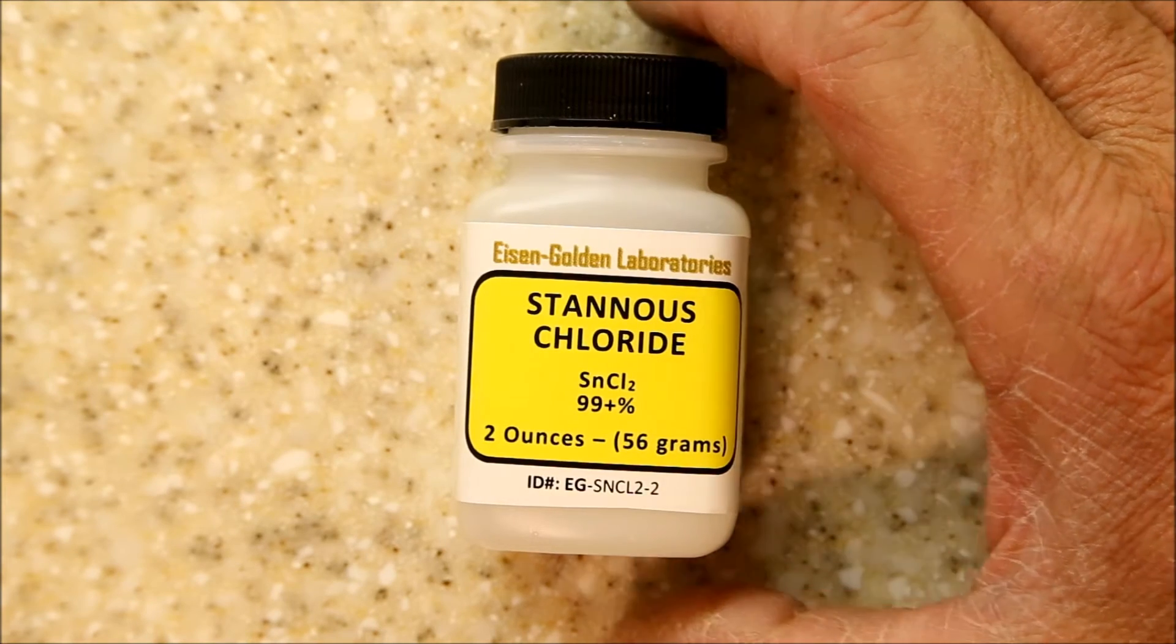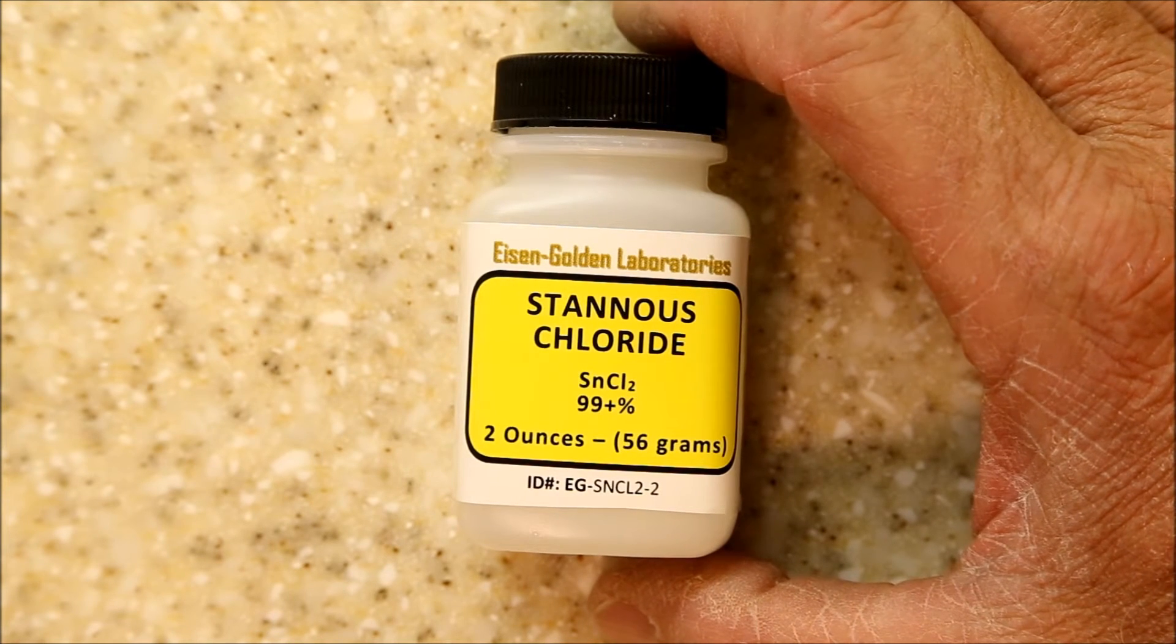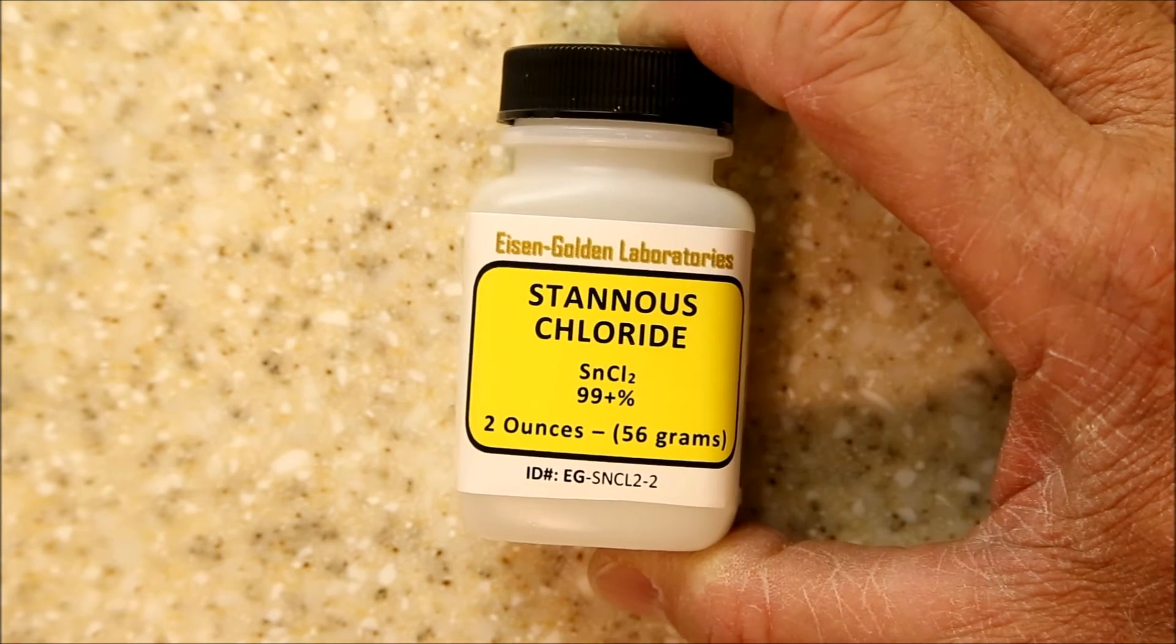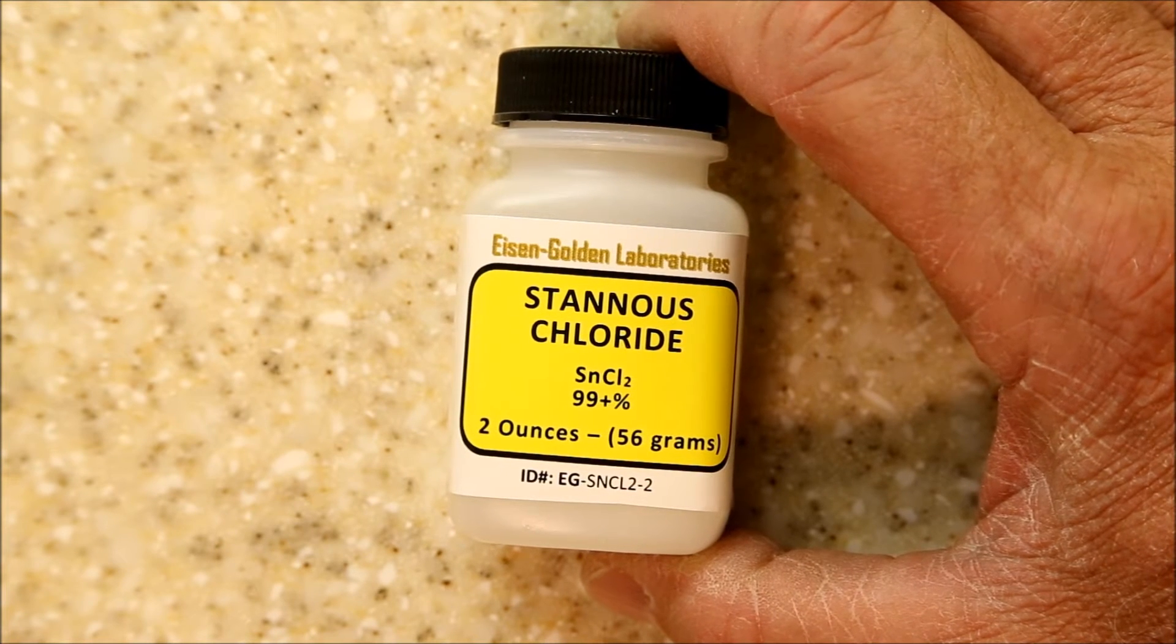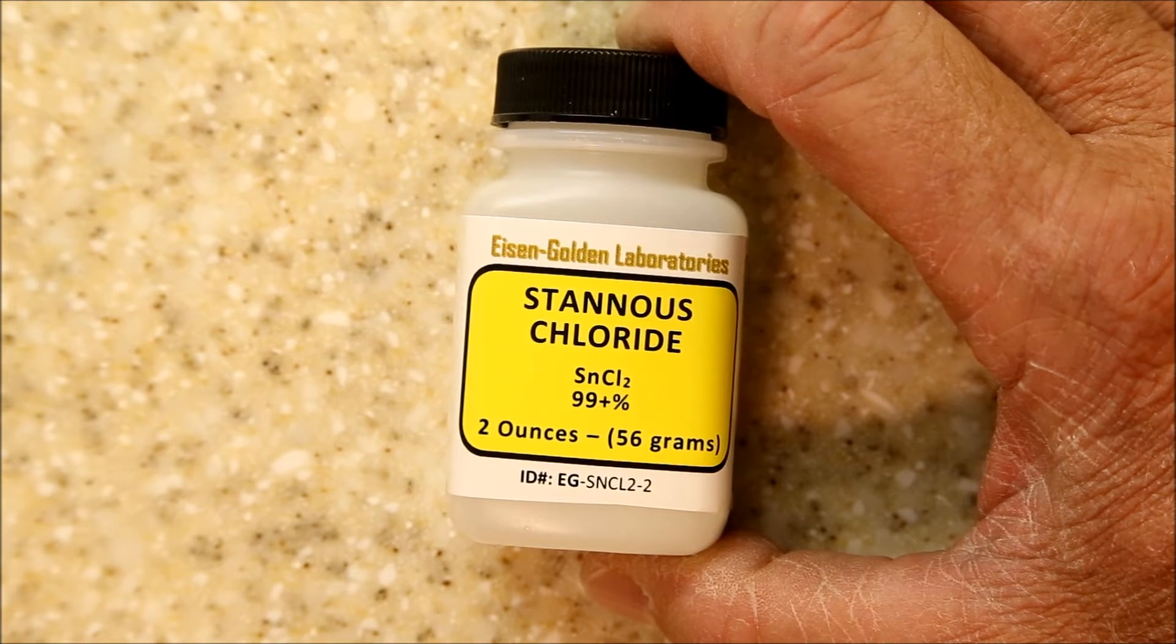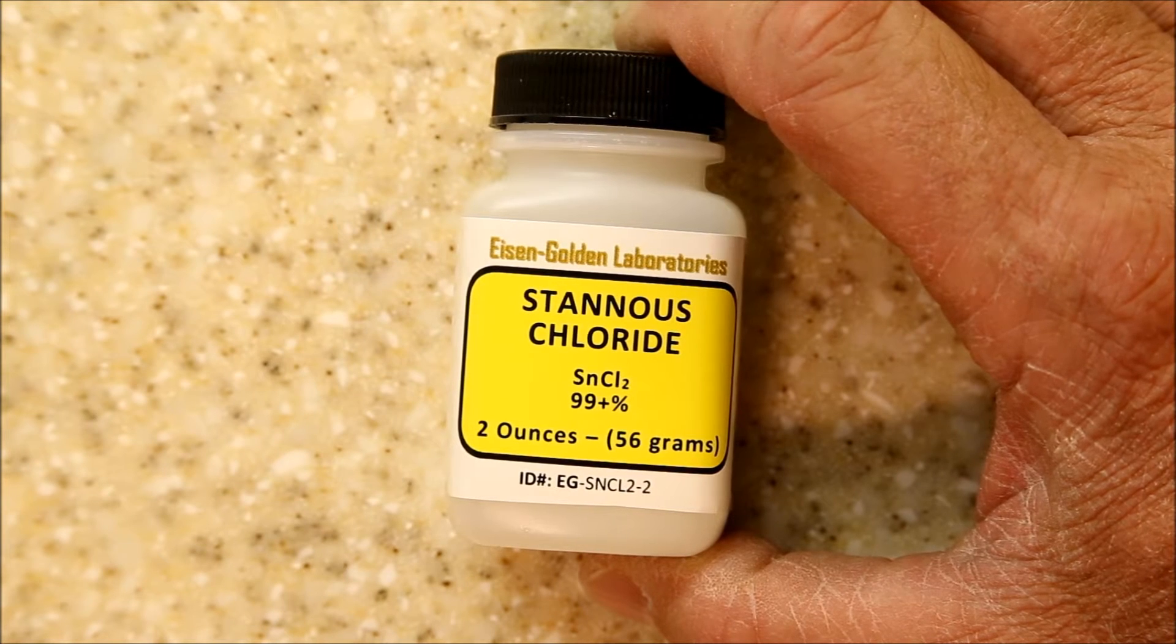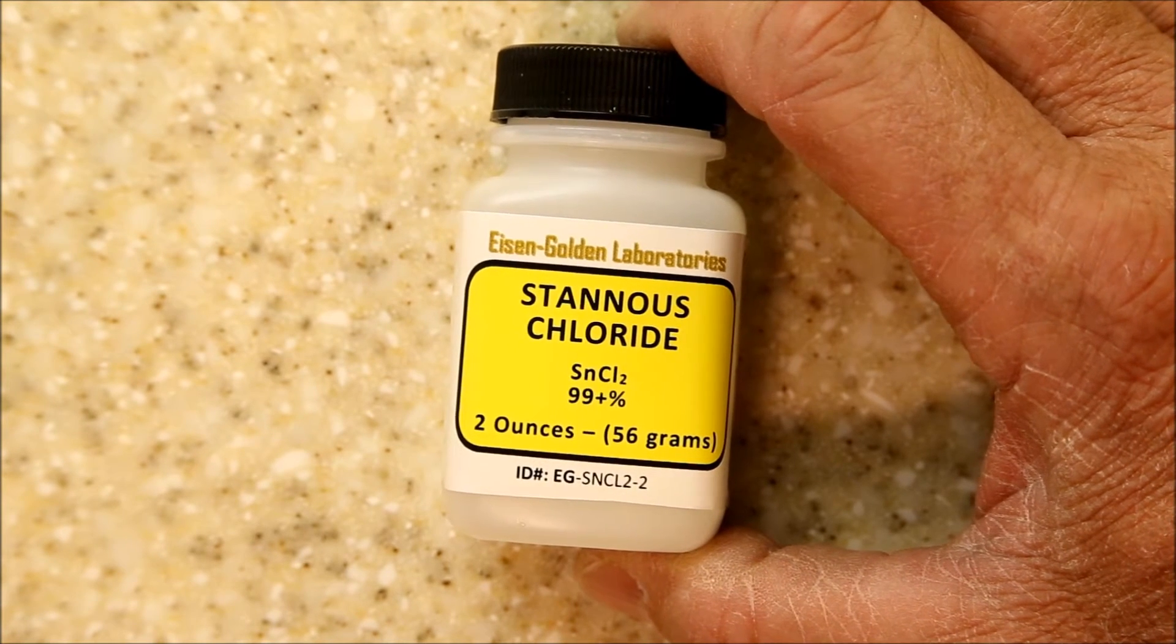The growing solution is a 50-50 mixture by weight of stannous chloride or tin chloride mixed with distilled water. There are many different combinations that you can use, ratios of weights, but I found the 50-50 works well.